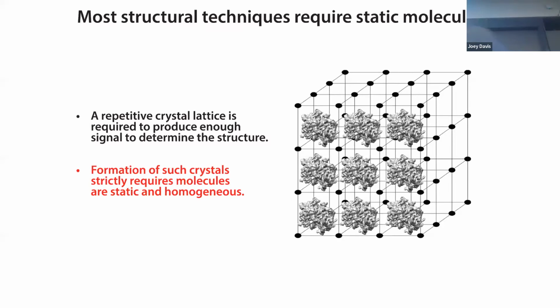Most of the structural data that is in the PDB that folks in design are leveraging comes from X-ray crystallography. I just wanted to spend a quick second on how people think about this data and maybe how it impacts the design paradigms that you use. The fundamental problem with imaging biological molecules is that they get damaged by radiation, whether that's from X-rays or from electrons. If you're going to take a picture of it, you're going to irradiate it. That radiation is going to cause some sort of damage, which means that you have to limit the amount of dose that you have on any particular particle.